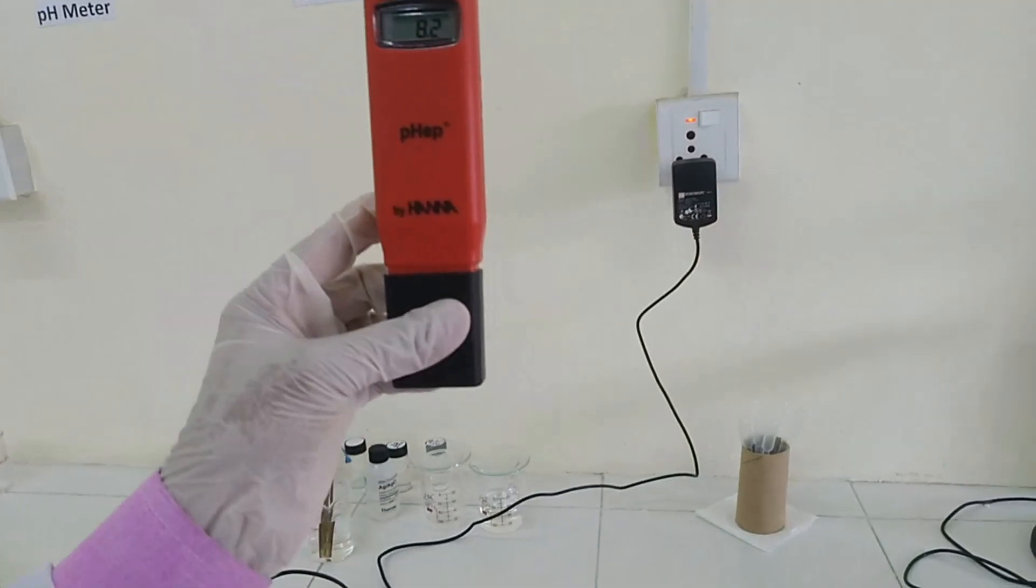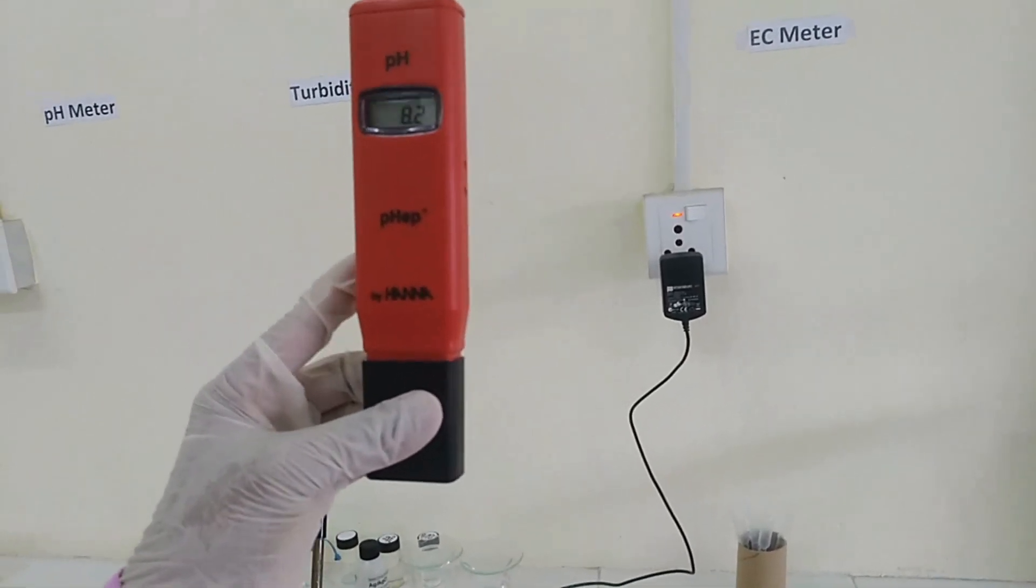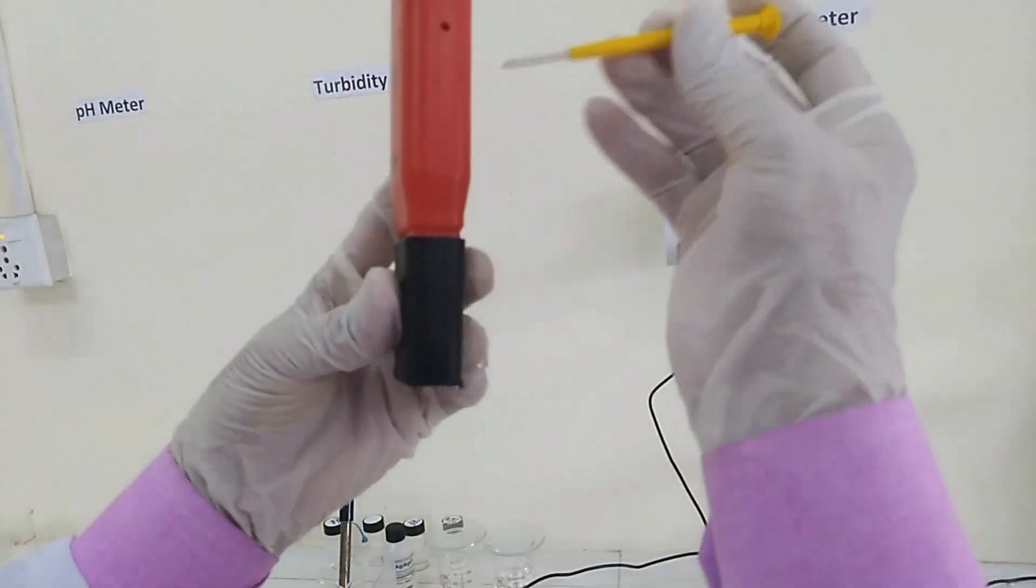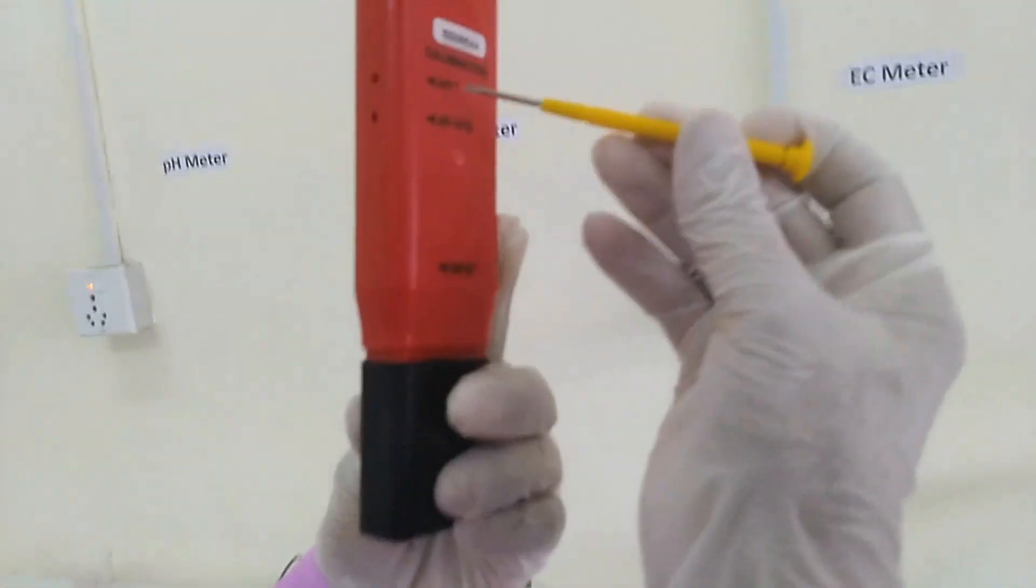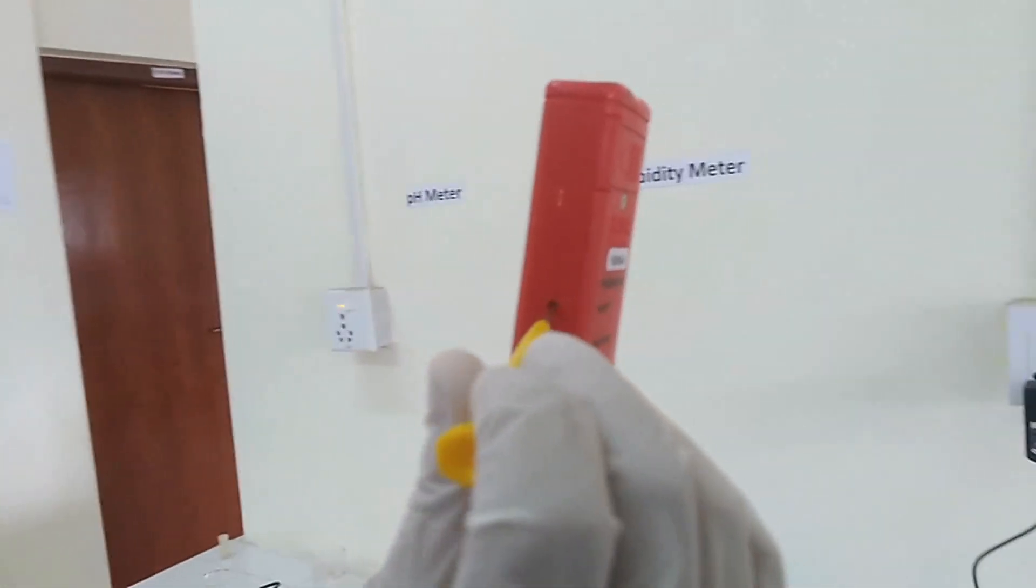See the reading. Wait for stable value. Insert screwdriver to the hole corresponding to pH 7.01 and slowly rotate the screwdriver clockwise to increase the value and anticlockwise to decrease and make the value 7.0.